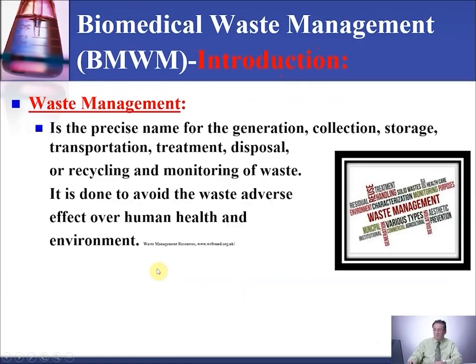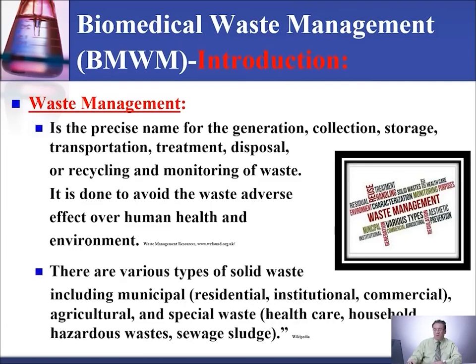Waste management, on the other hand, is the precise name for generation, collection, storage, transportation, treatment, disposal, or recycling and monitoring of waste. It is done to avoid the adverse effect of waste on human health and the environment. There are various types of solid waste, including municipal, agriculture, and special waste like healthcare waste.